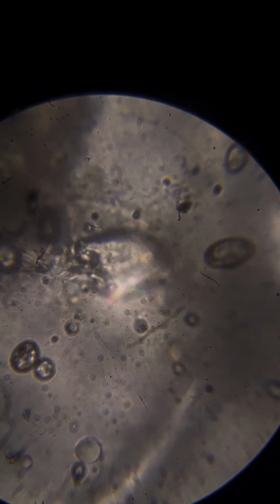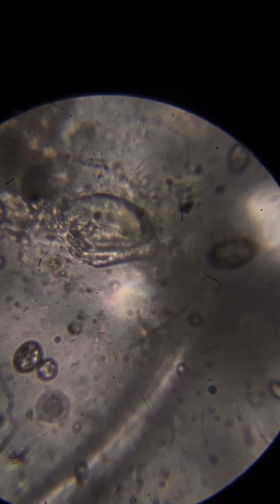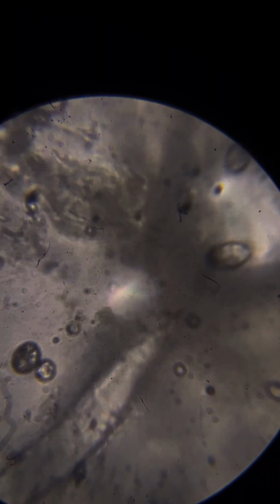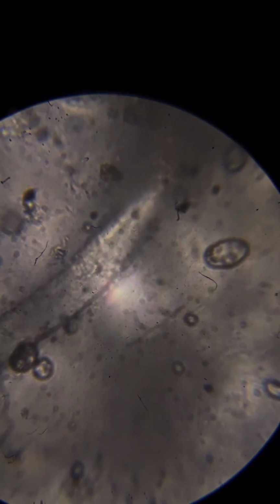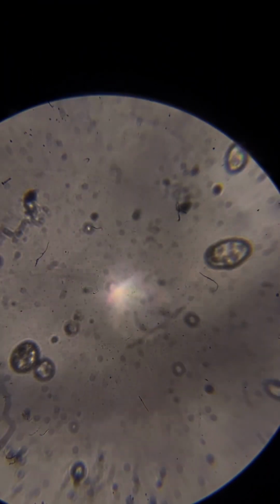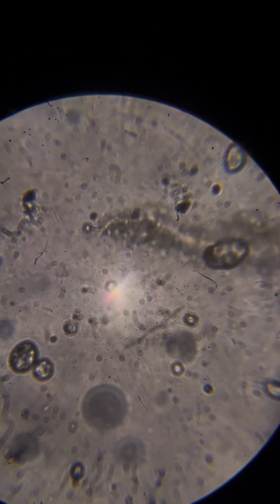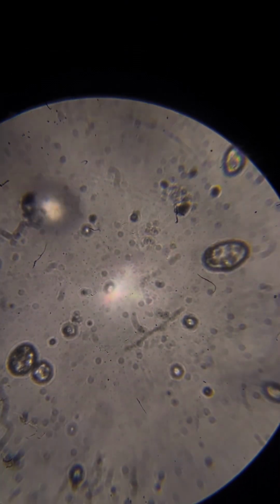Okay, so we see some flow. It's because it's a newly prepared slide, and also when I use the focus ring, this lens touches the slide, so you get these flows in the liquid.